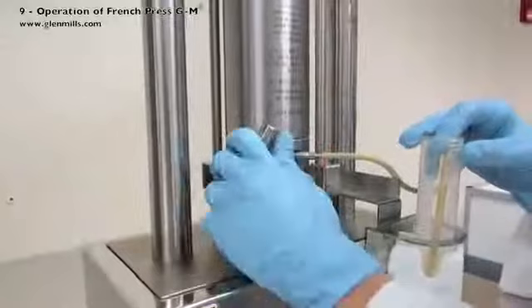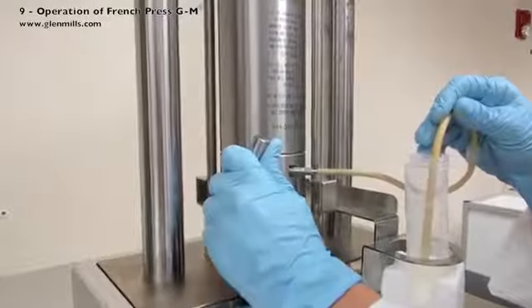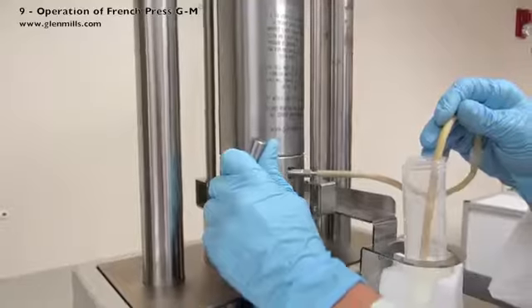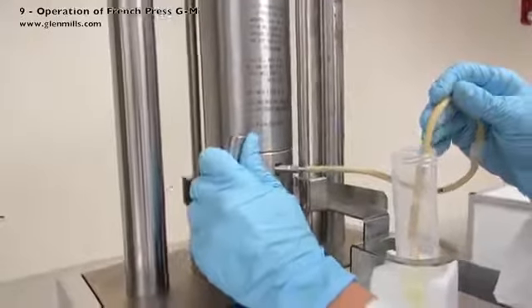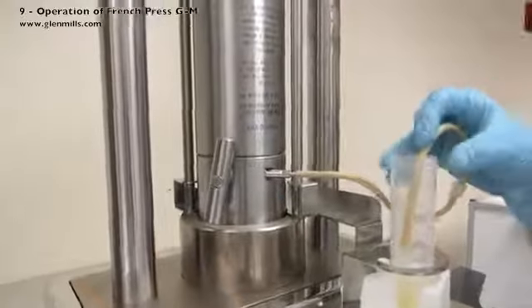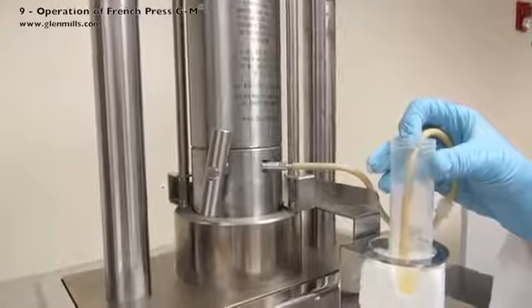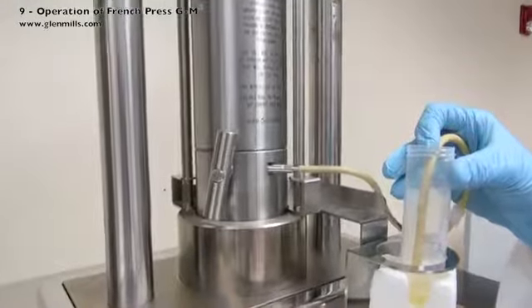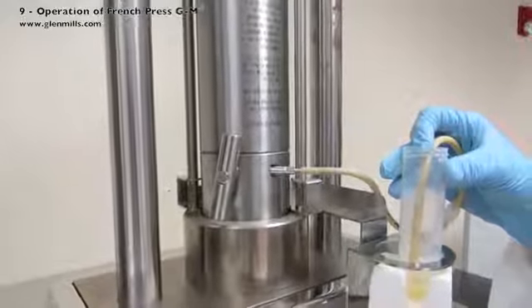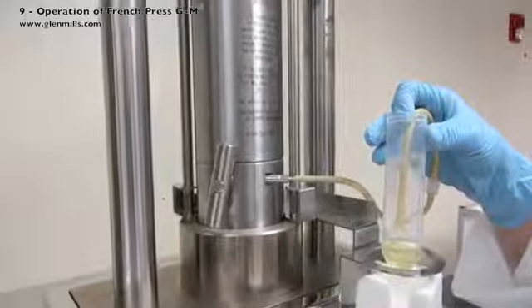Slightly turn the sample valve assembly counter-clockwise to allow the sample to exit the sample outlet tube. Direct the sample dripping out towards the collection beaker. We need to keep the pressure above 1000 and give the hydraulic pump a chance to catch up, so we gently turn the valve and keep the PSI above 1000 to ensure lysing. Adjust the valve assembly so the flow rate is about 10 to 15 drops per minute.